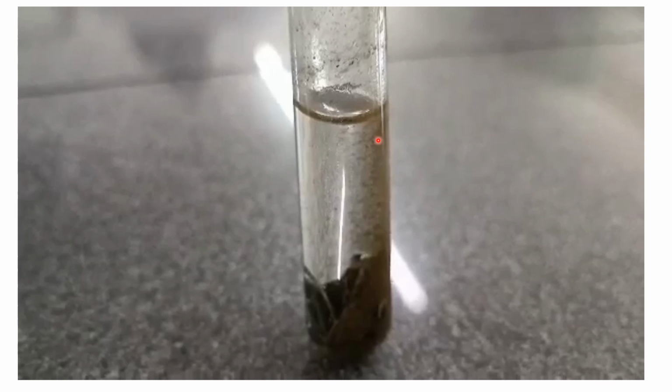What else do we observe? Brown deposit, brown product. This is copper. Then this portion, the supernatant, is evaporated to dryness. Take note, it is colorless, there is no more blue. This means the copper was used up, because the color of copper in solution is blue.